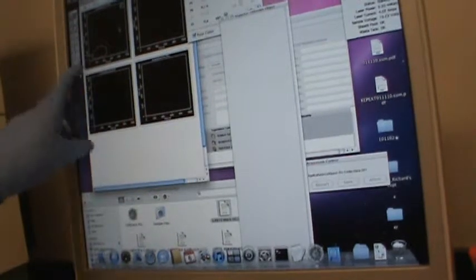What I can do is move this number, because otherwise it's in between. If my cell population is here, I don't want this number to be here. So I just move it. And so I have my gate.